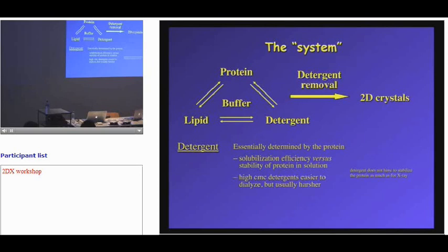And I think the cases where you get excellent crystals were often the cases where you had X-ray quality to start with. So I think we should try to find a purification that is as perfect as you will need for 3D crystals, and then try to go for 2D crystals, and you have a better chance of getting to very high resolution data in the end.